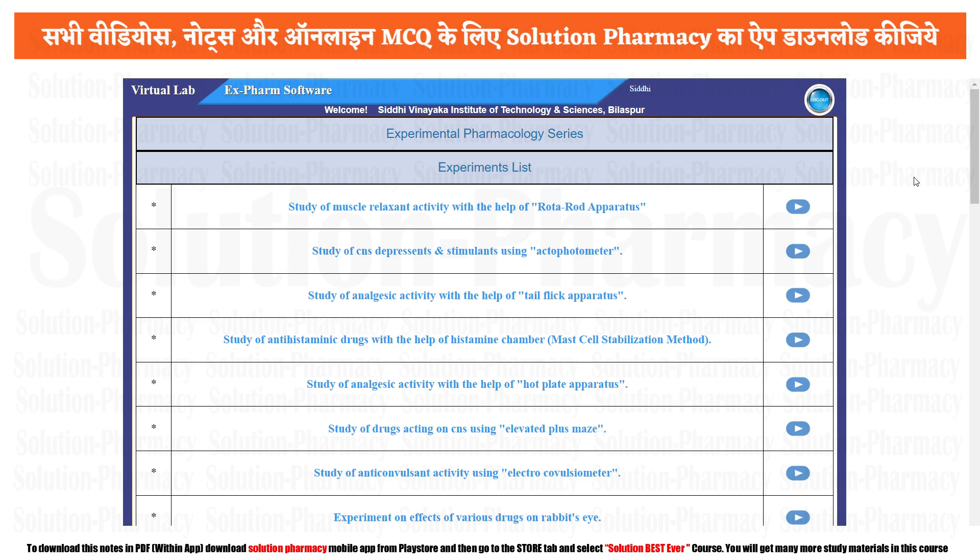To perform this experiment and to gain some knowledge we need Xform software. Xform software is an excellent replacement for in vivo or in vitro experiments where we do not require any physical experimental animal. We can perform and learn the experiment — objective, process, procedure, and outcome — without using a real animal, with the help of in silico software.